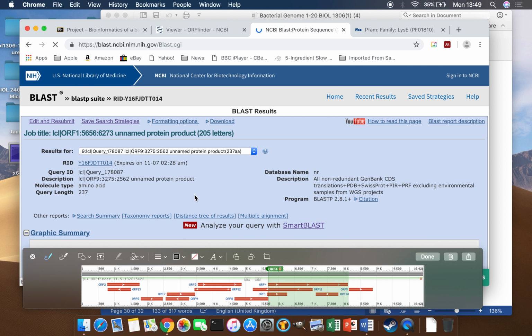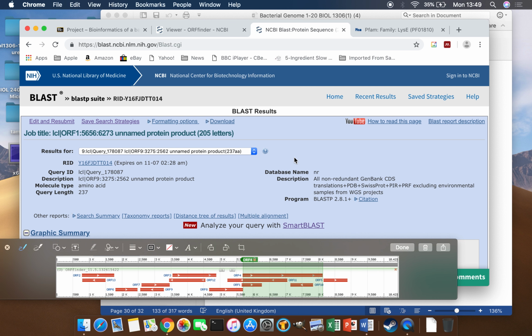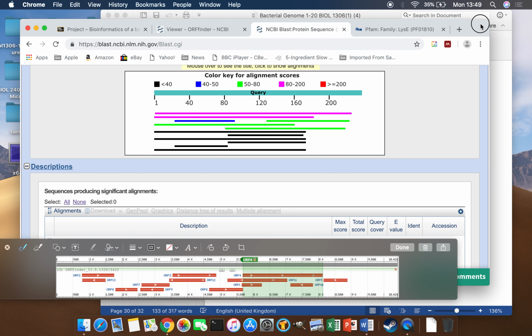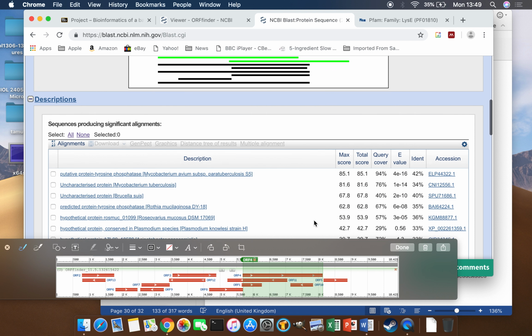So that was open reading frame 8, and open reading frame 8 on our chart. Here, let's drag it up here. There it is. Open reading frame 8. So yeah, okay. And yeah, interesting. So, fine. Now let's go. Here's open reading frame 9. Whoa, okay. Open reading frame 9. The trash train continues to pull into the station. Wow, that's really something. That's a lot of junk.